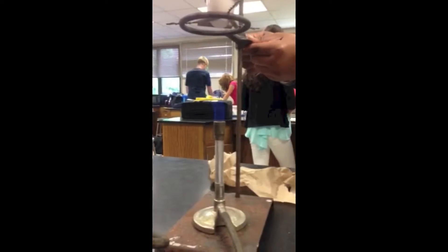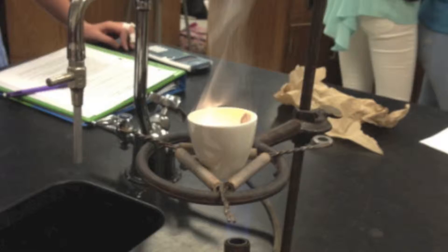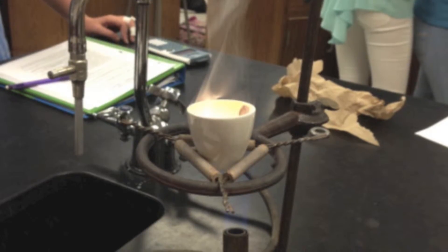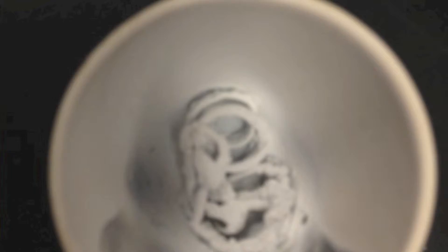We then lowered the crucible and turned up the Bunsen burner so that the bottom of the crucible would become red hot. This is a picture of the crucible really steaming after we turned up the Bunsen burner. This is what the coil looks like after we had put it on the Bunsen burner.